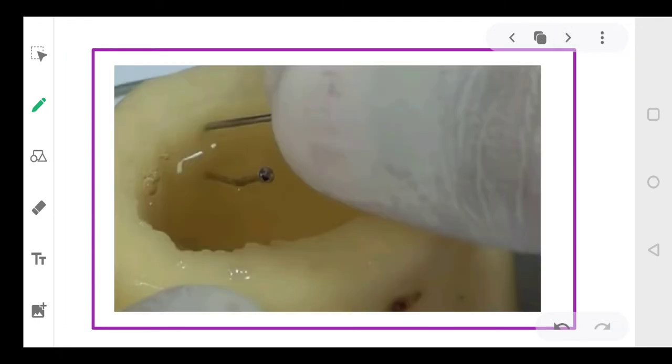Now we will leave this experiment for 2 hours. We will leave it undisturbed for 2 hours. And after 2 hours we will observe, we'll mark another pin to see the increase in the level of the sugar solution. Okay, dear students, we will observe the increase in the level of sugar solution.